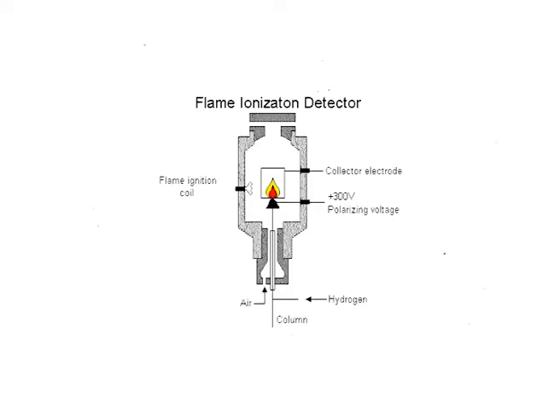The chromatogram: various solutes emerging from the column are observed with detectors. The detectors may be specific for a type of solute detected. A chromatogram is a graph showing the detector response plotted against the elution time. In figure 2, a chromatogram of two components, such a plot is useful for carrying out both qualitative and quantitative analysis. The position of the peak on the time axis is used for qualitative analysis, whereas the peak areas reveal the quantitative aspect of the components.